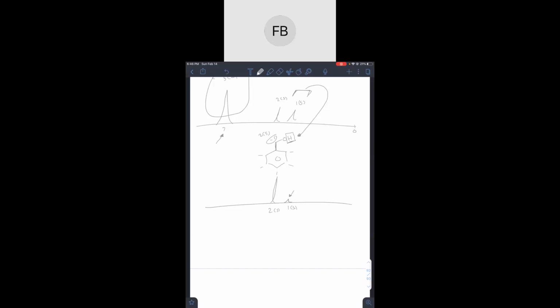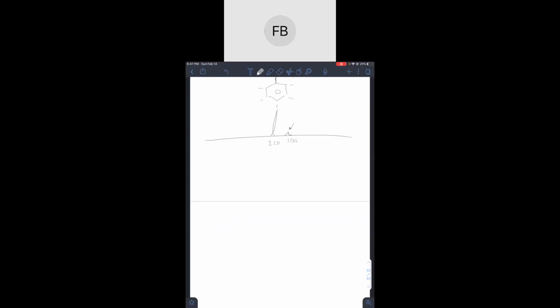So the only thing I wanted to say is that it's not any time you see a 1 singlet. So let's come up with an example. A 1 singlet, what does that mean? It means 1 hydrogen that is a singlet. So we could easily do that. Let's say that I had something like this. So this has 1 hydrogen off of it. And then, let's say I put bromines here. That's a 1 singlet, right? So there are a lot of different ways you can have a 1 singlet. So it's not the 1 singlet part, it's the way that the 1 singlet looks and the location of it. It's around 3 or 4. It's very wide, very, very short. It's like a tiny little blip. It looks very different than all your other singlets.